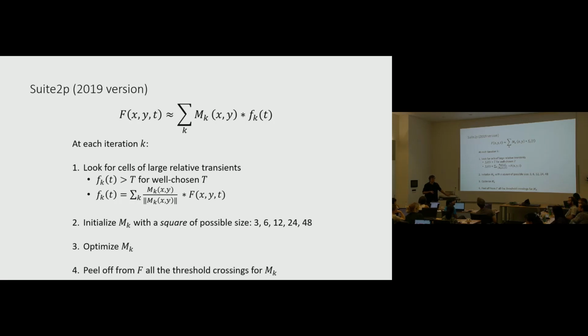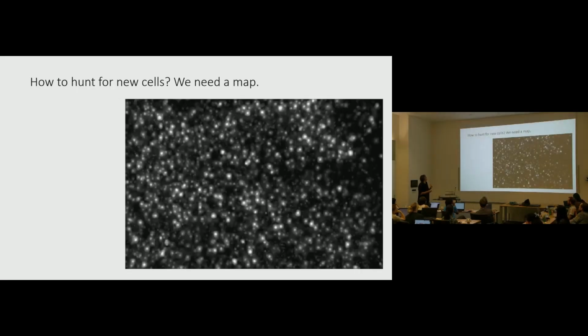And if you're looking for axons? It will do something similar, except for this one part that I didn't actually mention. Okay, so this is our map. It's very similar to the correlation map. It's a little different; the details are not super important. It's not quite the correlation of a pixel with the nearby pixels, because that doesn't have a concept of sparseness. We want to use this intuition we have that if a cell is active on even a few frames very highly, we want to keep it. And so this is instead basically a maximum projection at multi-scale to try to determine the best candidate pixels. So that's how it differs. We still call it a map because we think of it as the map that we go to introduce new candidate regions.